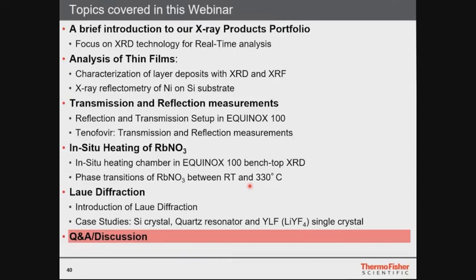Yes, of course. As I mentioned, there are specific SAXS instruments where you can measure down to, I don't know, maybe 0.1 or even below 0.1 degree 2 theta. What we can do is, depending on the setup, we can measure down to something like 0.5 degree with a big floor standing instrument, and the bench tops can reach something like 1.5 degree 2 theta.